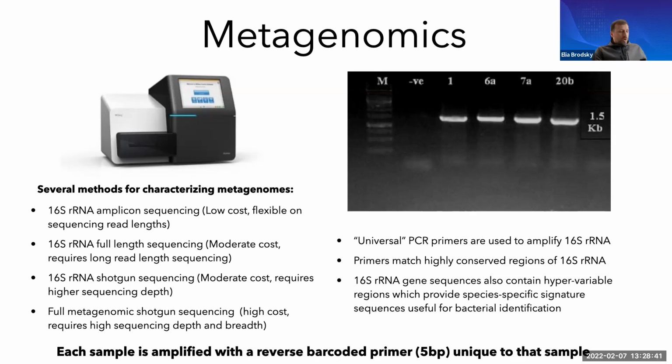Okay, so today we will take a look at one of these examples. One of the types of sequencing that is commonly used for metagenomic sequencing is the sequencing of the 16S ribosomal RNA gene. So 16S amplicon sequencing is a technique that is widely used to study the microbiome directly in its environment. It focuses on the 16S ribosomal RNA that can be amplified with PCR amplification.